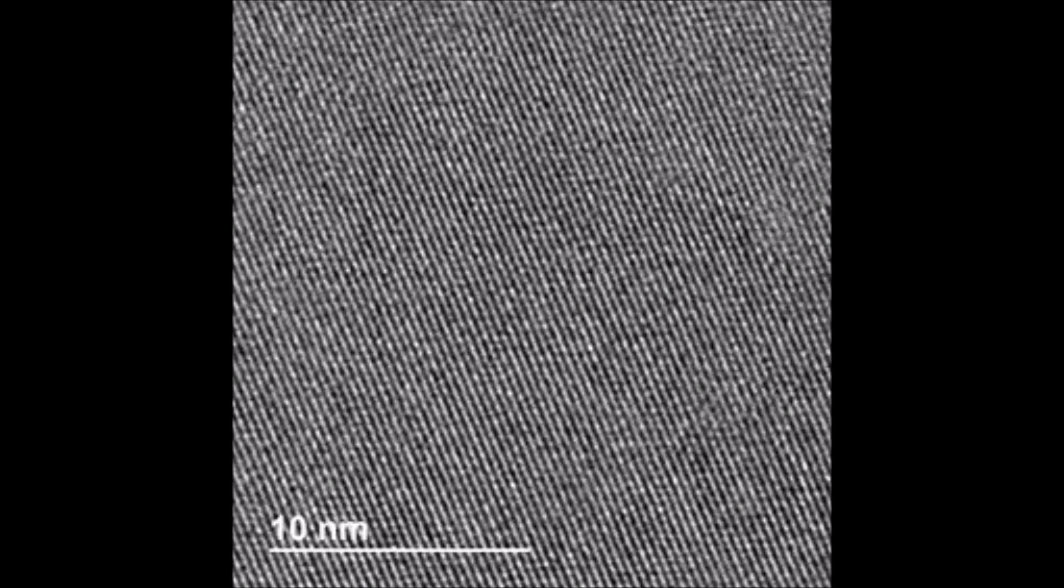So if we look at the same specimen but with the zone axis not well aligned, and in this case I'm off by about 17 milliradians, which is about one degree, we see a marked decrease in the level of detail that can be observed in the image.